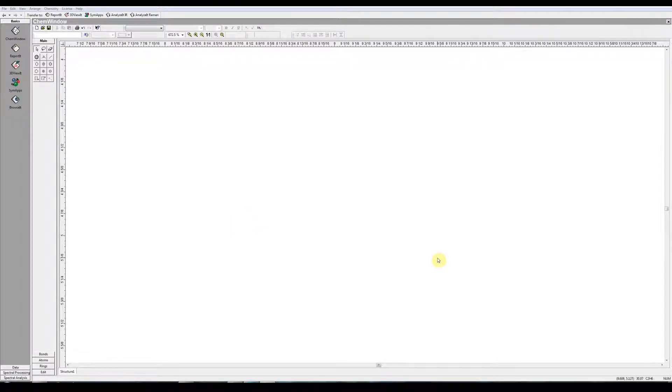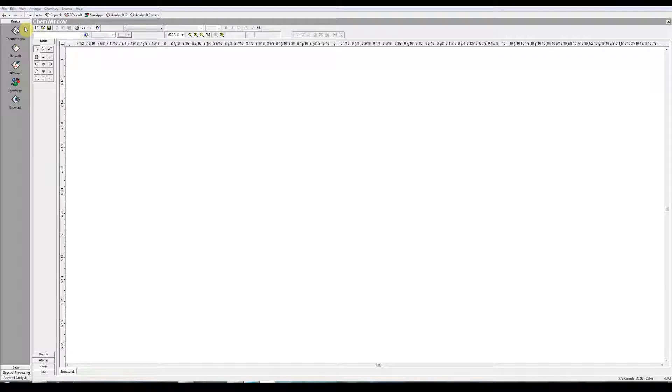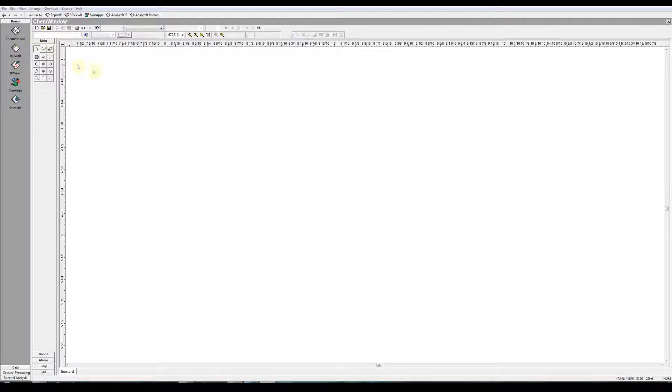When you save a ChemWindows file, the settings will be saved with it. And the next time you open that file, those settings will be reset. ChemWindows files have a .DSF file extension.